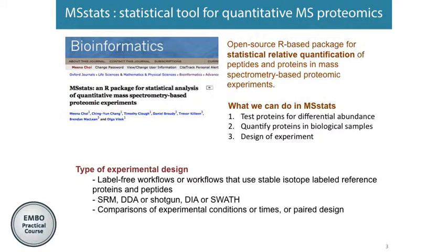For some specific subject, we can take the sample from a healthy cell or a cancer cell. This is a little bit different from group comparison, like healthy versus disease, which means the disease group takes cancer cells only from a diseased person and takes the same cell from another healthy person, so there are different subject groups. But paired design means for a specific subject we have multiple samples. So these three different types of experiment we can handle in MSstats. This is just a brief overview of what types of experiment we can handle in MSstats.